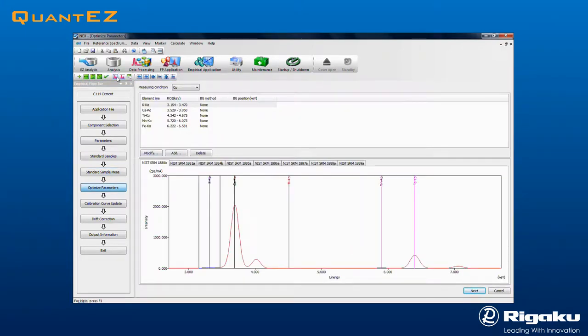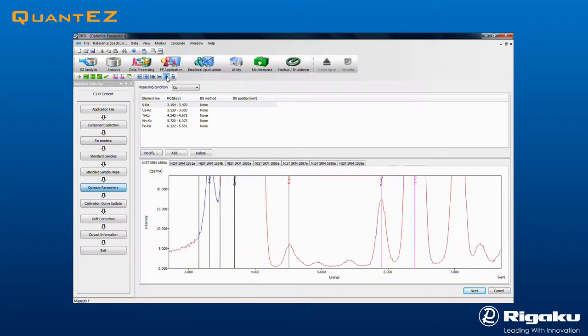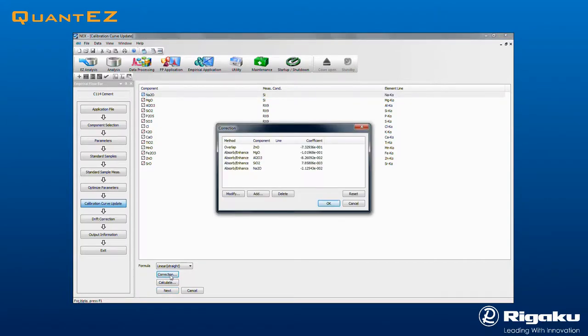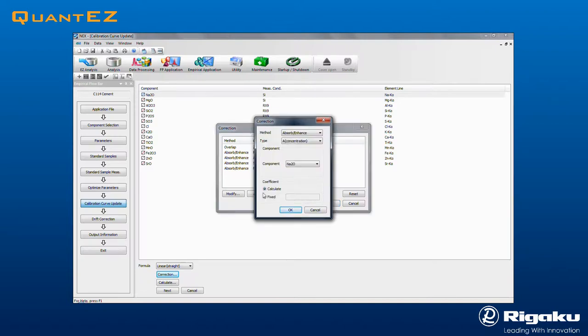Selecting Optimize Parameters from the flow bar allows inspection of acquired spectra from the standards. Clicking Next brings up the Calibration Curve Update screen, where methods may be optimized to correct for peak overlap, absorption, or enhancement effects. Clicking the Correction button brings up the associated dialog box.